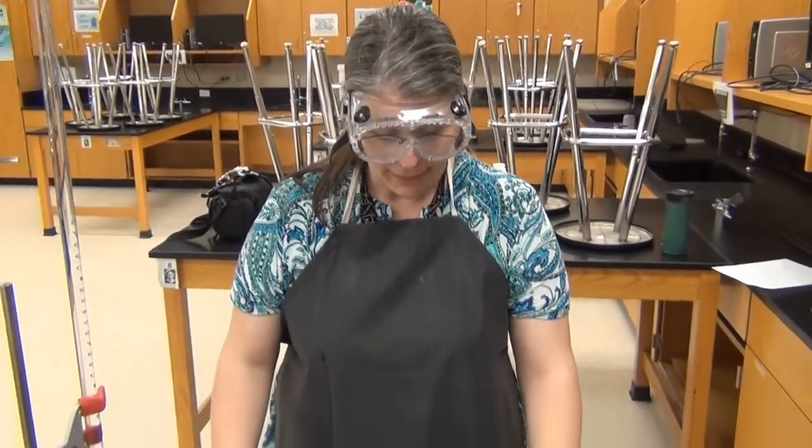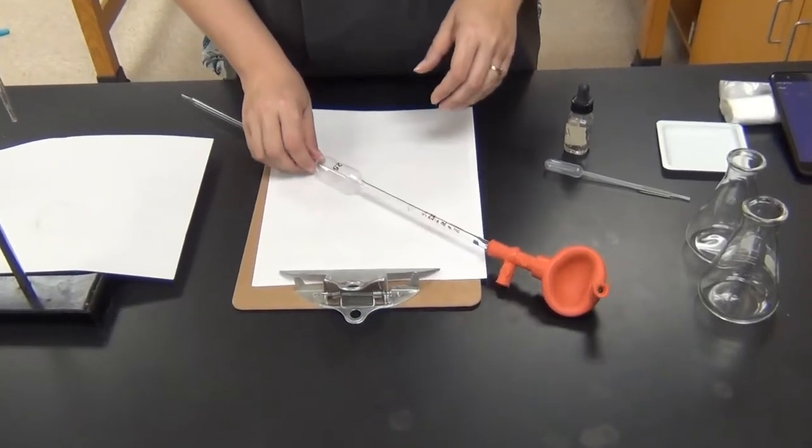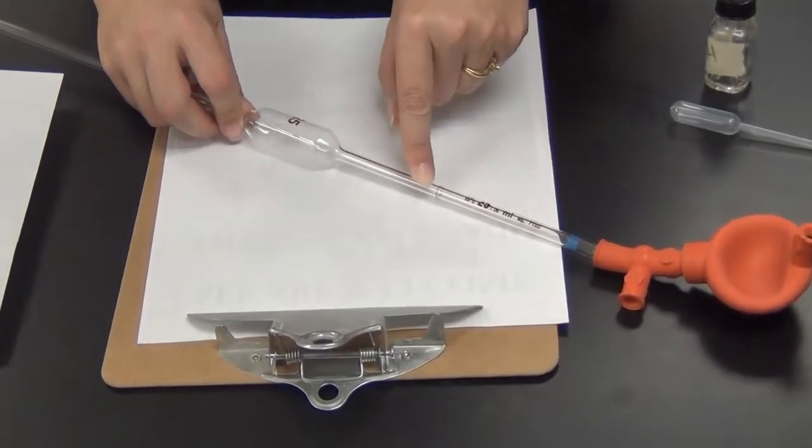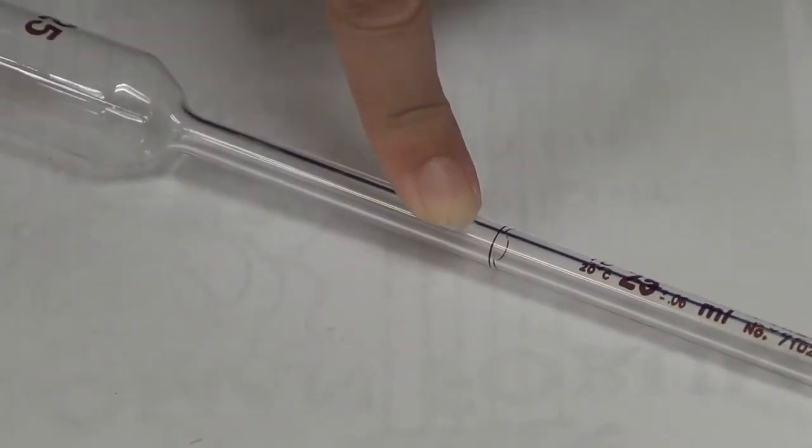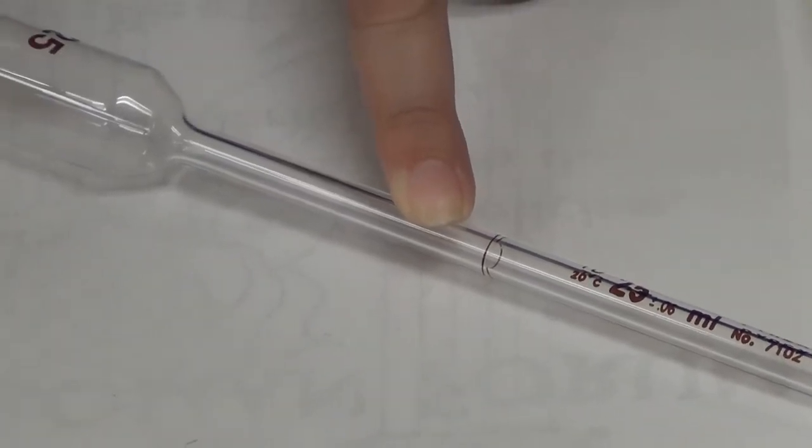This is a glass volumetric pipette, and it's very similar in ways to a volumetric flask, only it's for a smaller amount. If you look here it has exactly one, count it one, measurement mark, which means it does exactly one job. It measures 25 milliliters of solution.